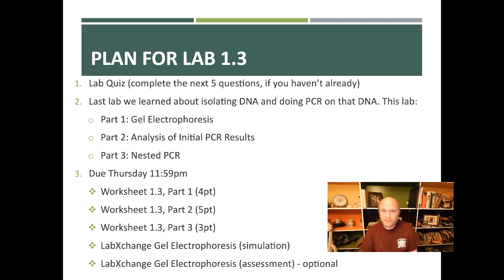With this being an online lab, we don't have to wait for a gel to run. We can just look at what the results would look like or should look like. And then we're going to do the second round of PCR to increase the specificity and the yield.